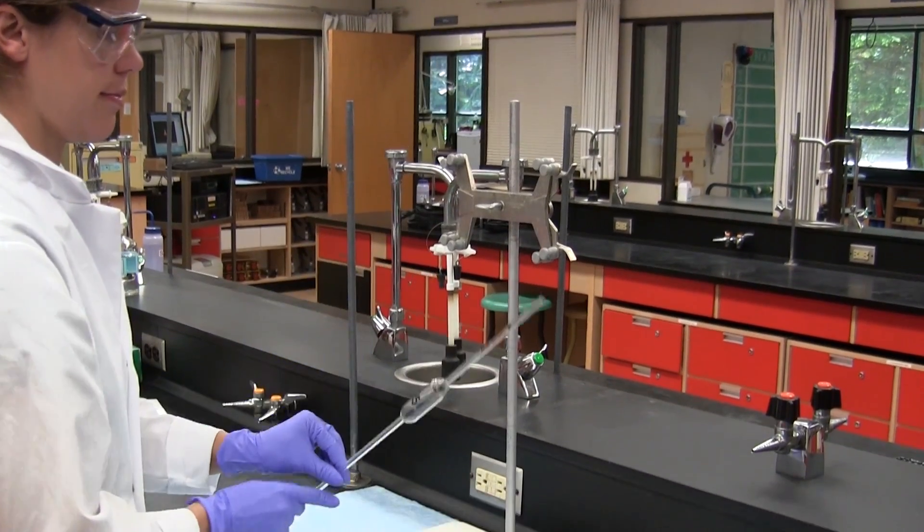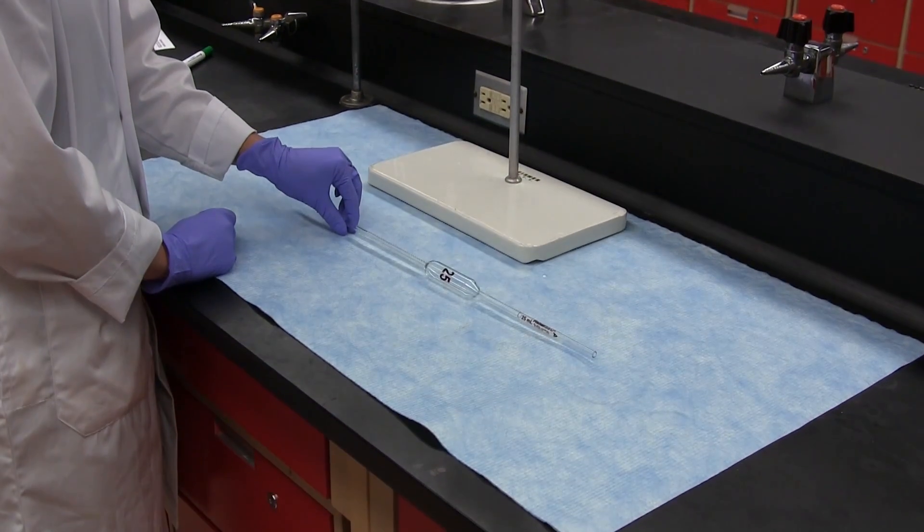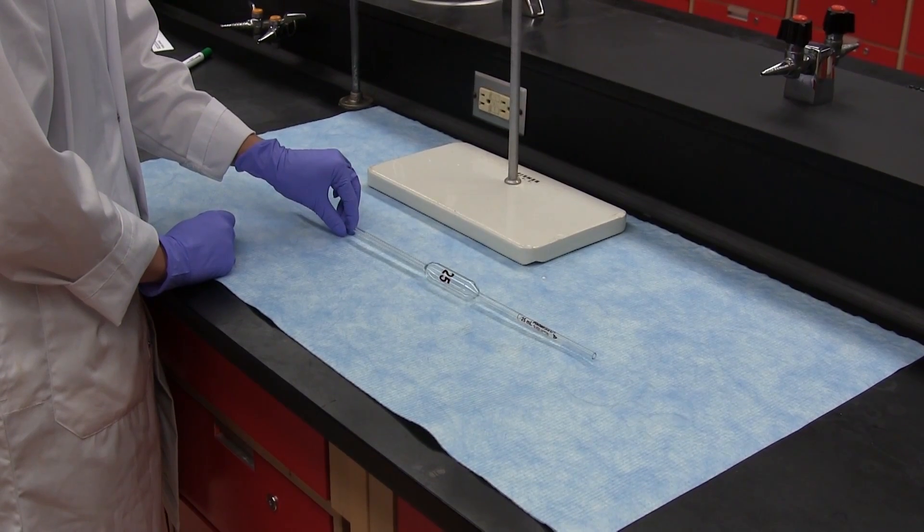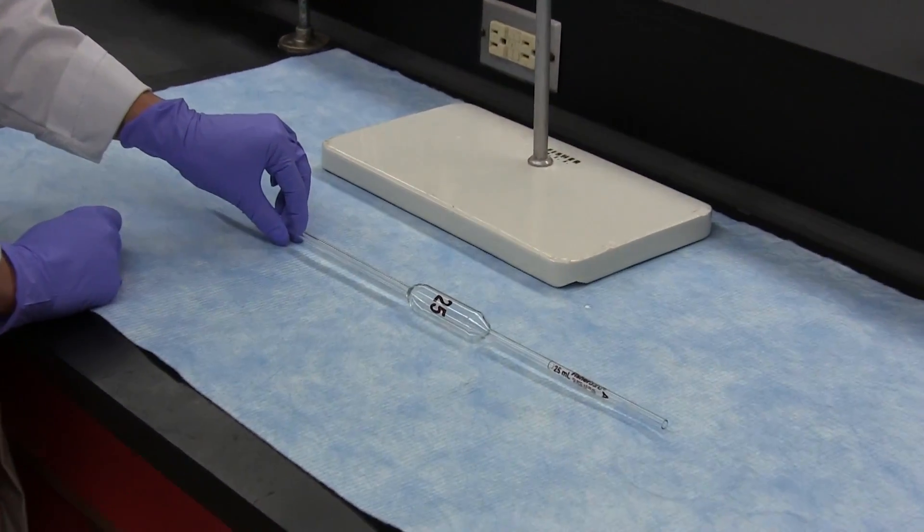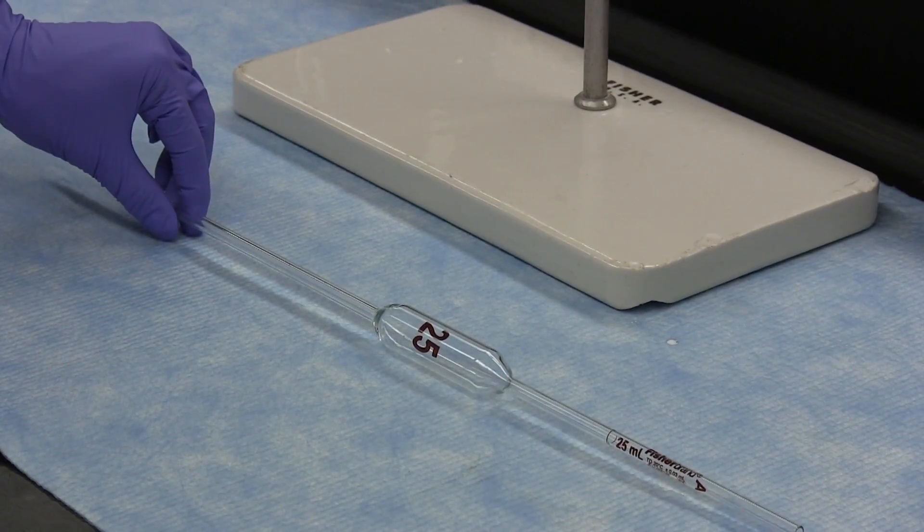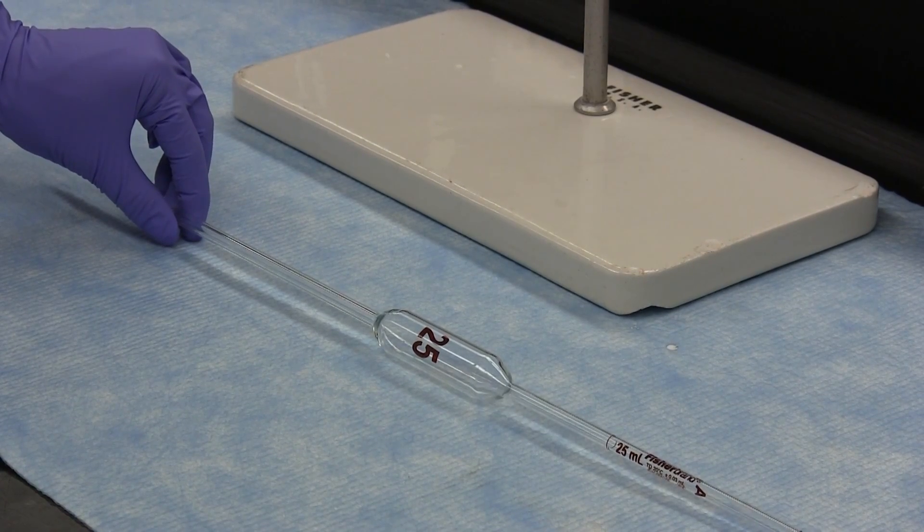This video shows you how to prepare and use a volumetric pipette. A volumetric pipette is calibrated to deliver a fixed amount of liquid with very high precision and they come in a variety of sizes.